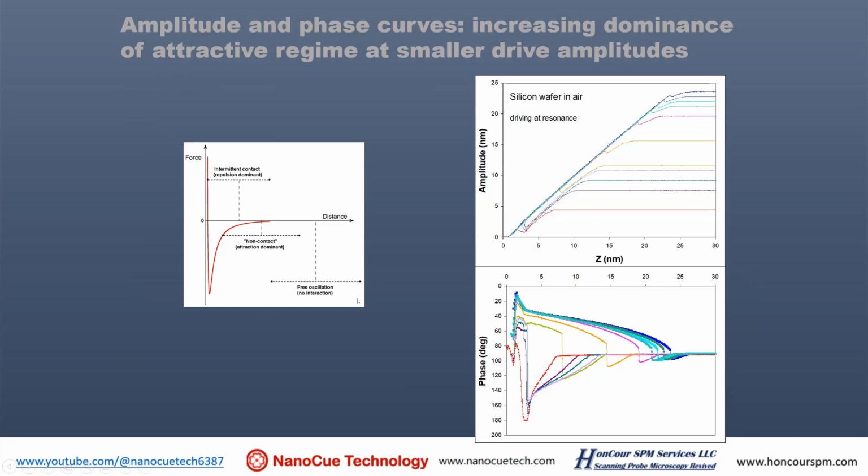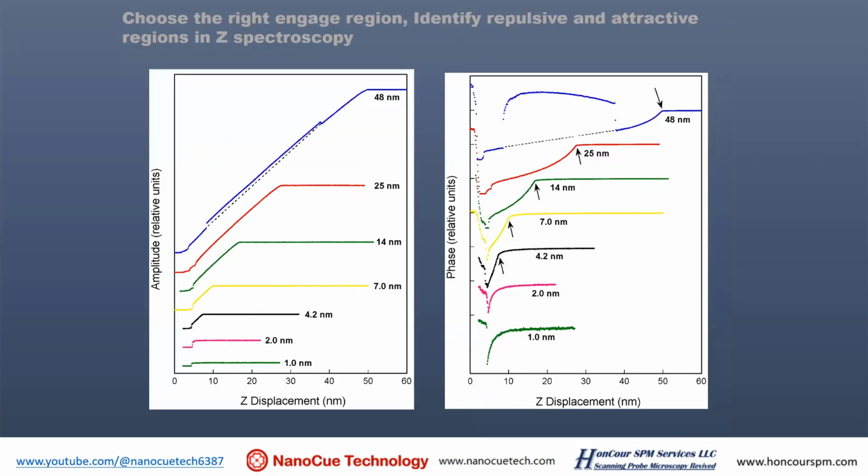If you oscillate the tip at high amplitude, the tip oscillates up and down with higher energy and higher power, so the tip is going to have more energy dumped to the sample, and therefore it applies more force to the sample. It's just a different view of it.